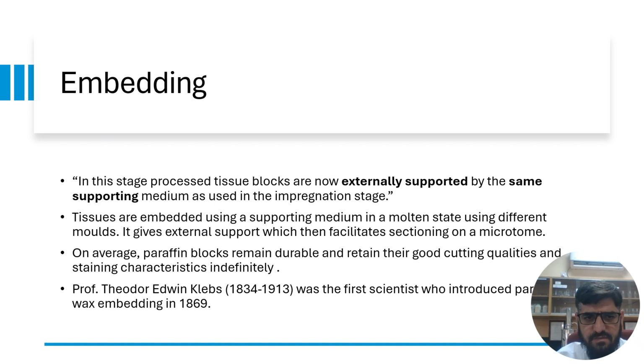On average, paraffin blocks remain durable and retain their good cutting qualities and staining characteristics indefinitely. Professor Theodor Edwin Klebs was the first scientist who introduced paraffin wax embedding in 1869.